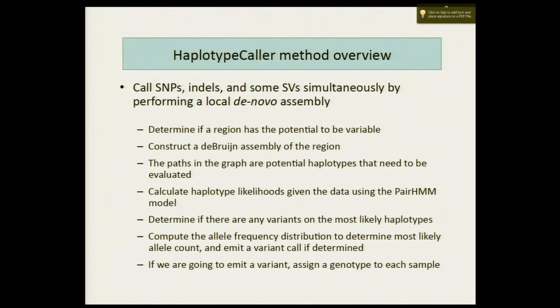What's up? Do we still need to do the realignment before the haplotype caller? So no, you don't. It wouldn't matter whether the reads are realigned or not. So you mean if we want to call haplotype caller, we can just go from the duplicate marking and then recalibration? Exactly. Yeah. So you save a little bit of time by not having to do the indel realigner step, I suppose, but you lose it in the fact that the haplotype caller is going to be much slower than unified genotyper. What's up? Is there any efficiency to be gained by moving this into the alignment software?